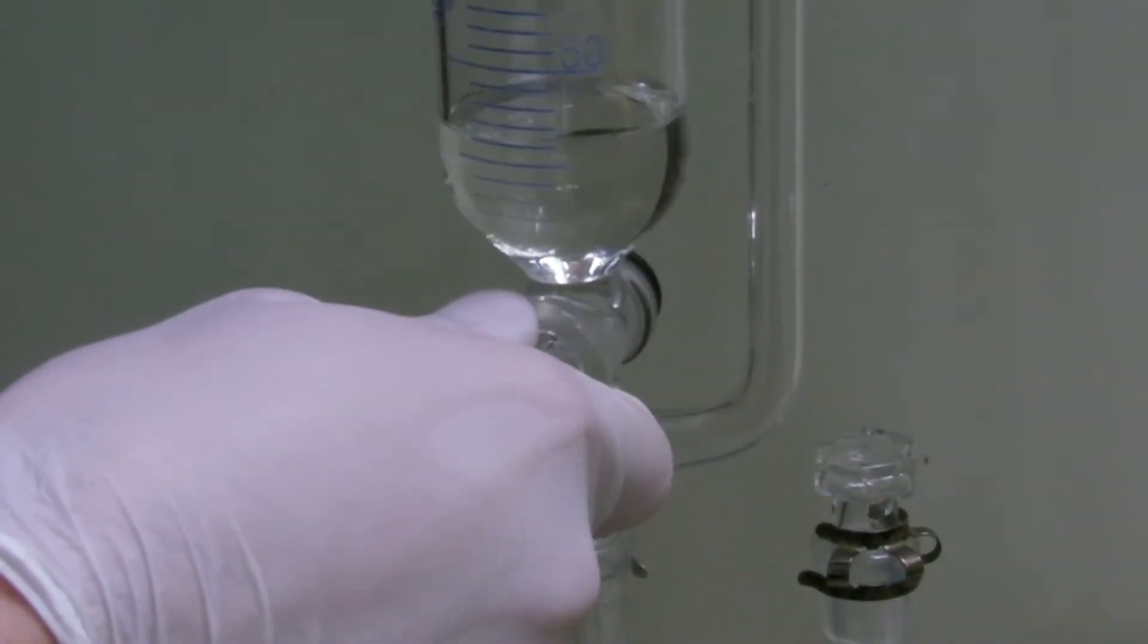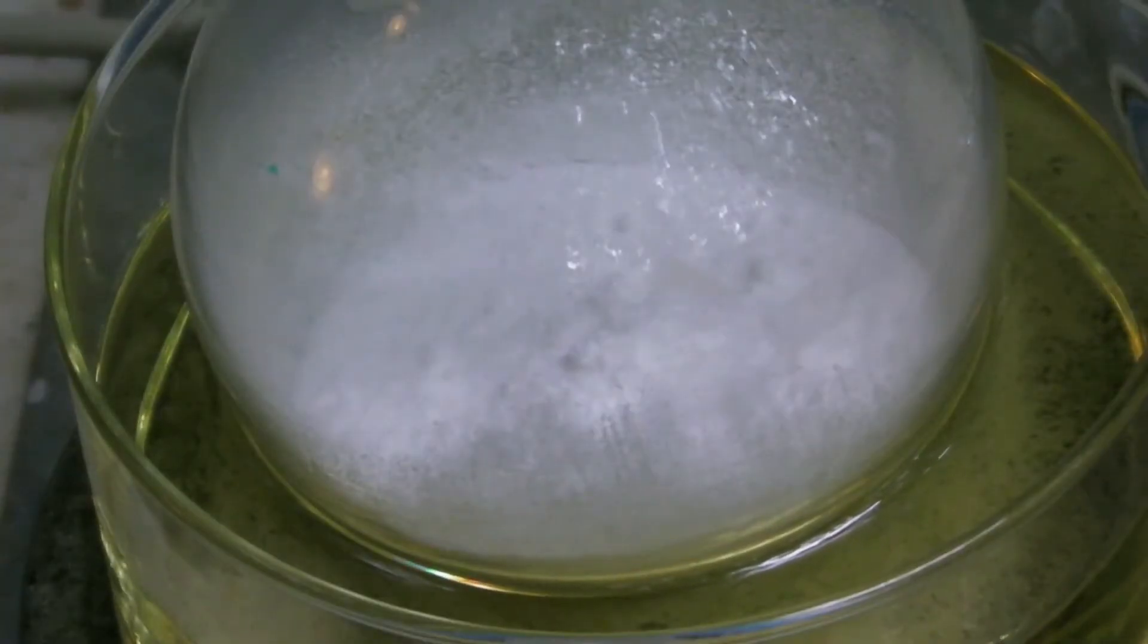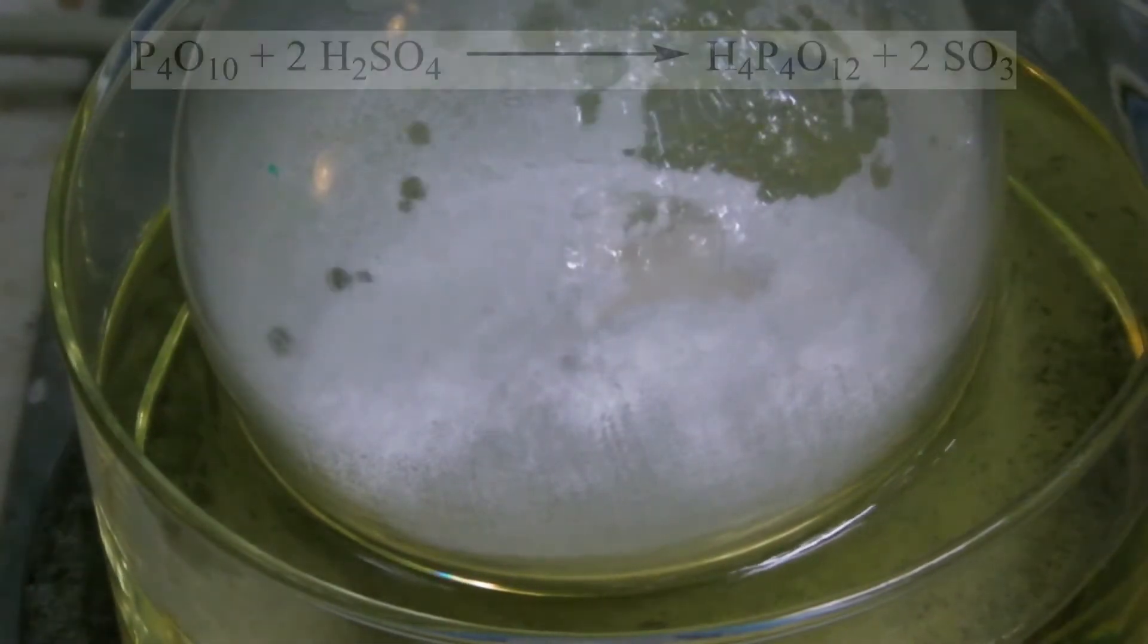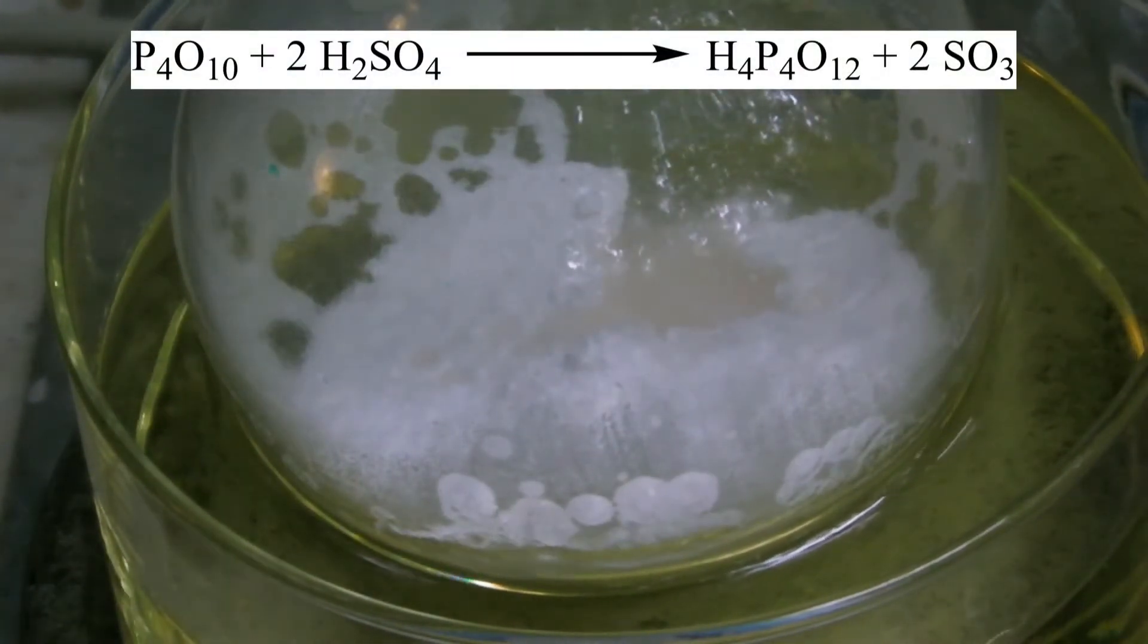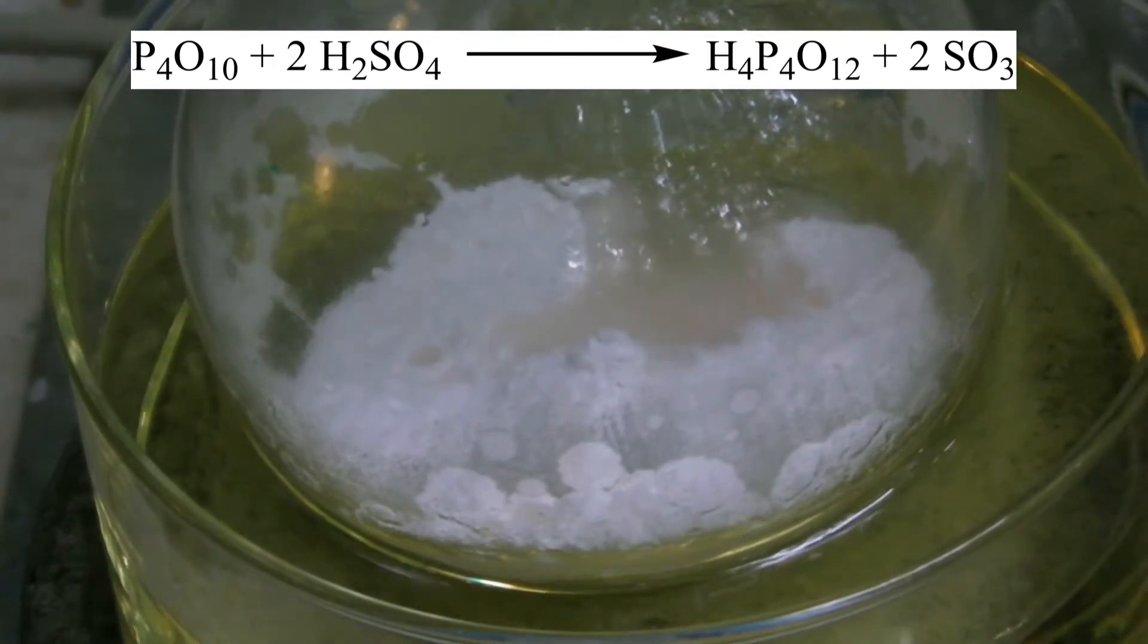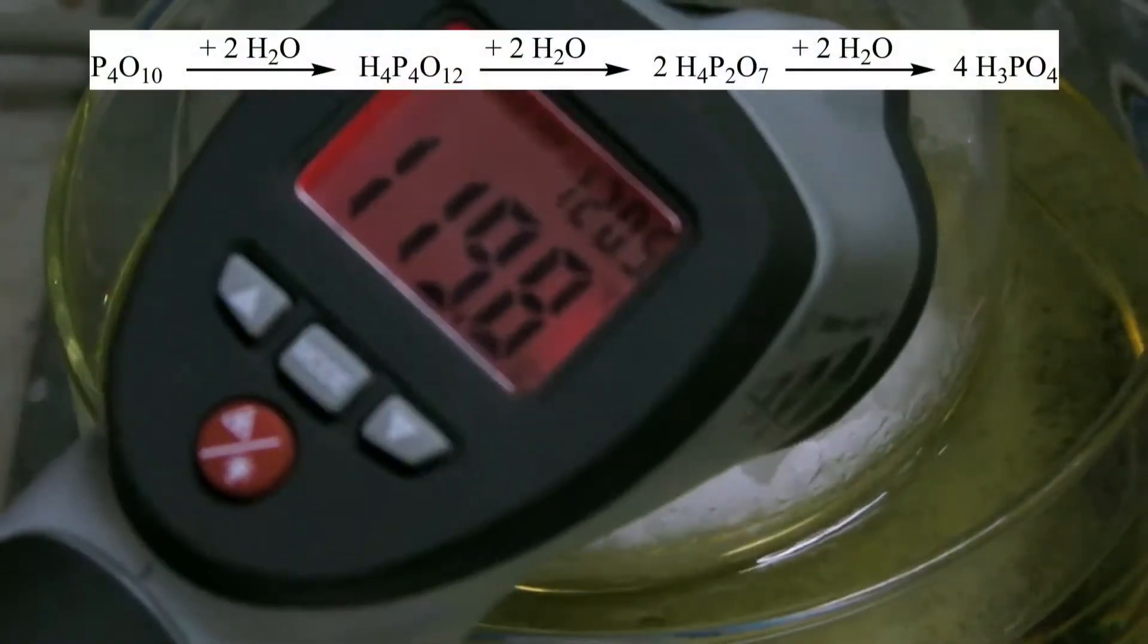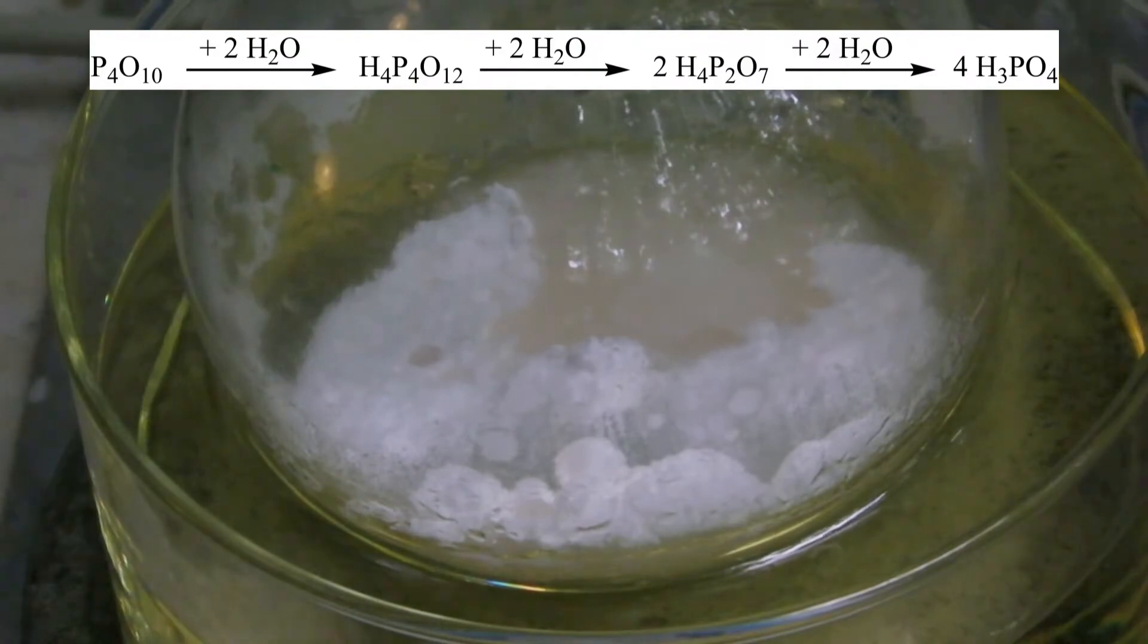Then a part of the sulfuric acid was added dropwise. The following reaction takes place: the phosphorus pentoxide reacts with the sulfuric acid to form sulfur trioxide and mainly tetra-metaphosphoric acid. This is only one of several chemical equations because phosphorus pentoxide could theoretically react with water until it forms phosphoric acid.